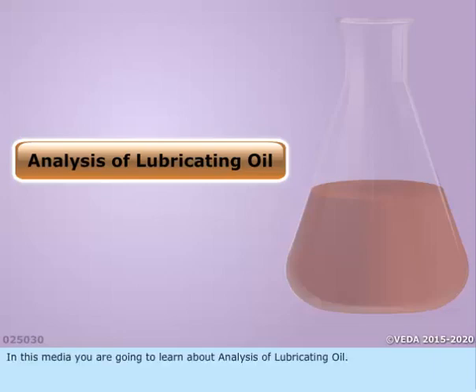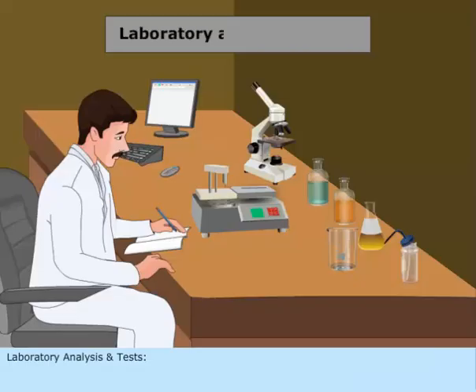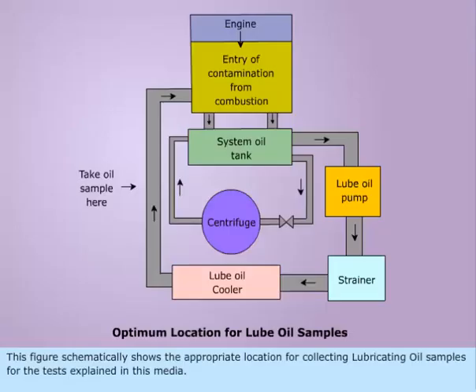In this media, you are going to learn about analysis of lubricating oil, laboratory analysis and tests. This figure schematically shows the appropriate location for collecting lubricating oil samples for the tests explained in this media.